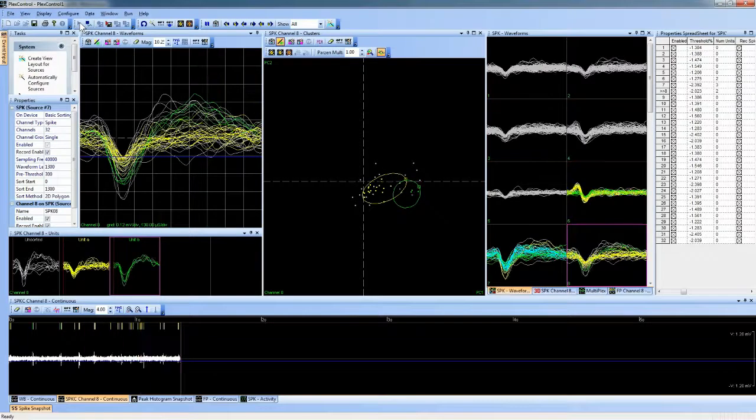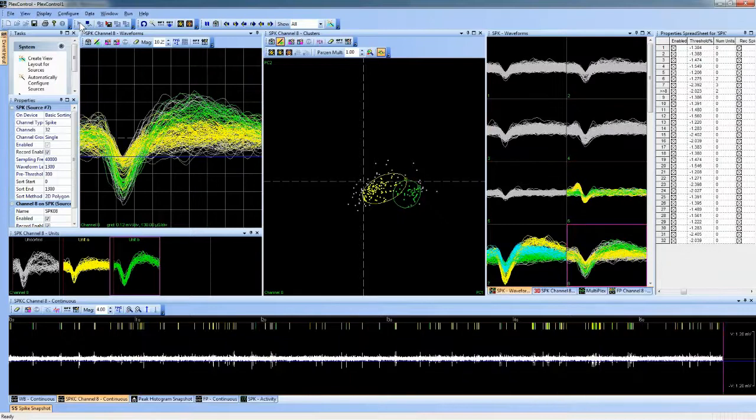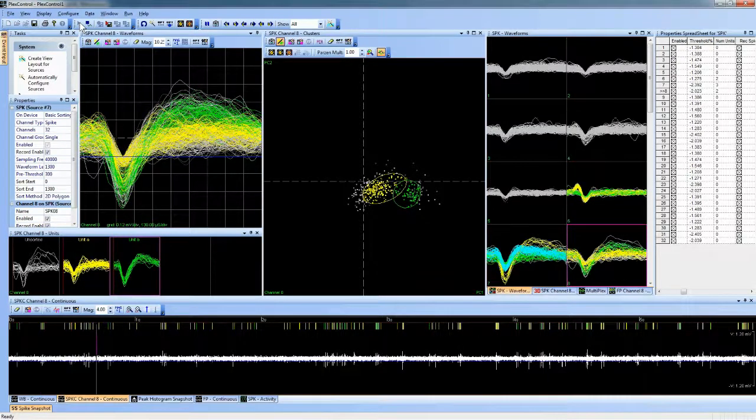It's a good question. Perfect. Thank you. All right. Another question, when using CAR or CMR, is it possible to see or better save the value that is being used as the reference?